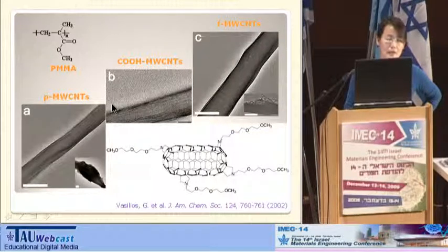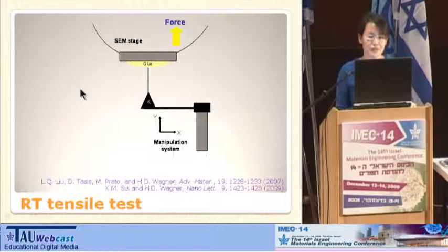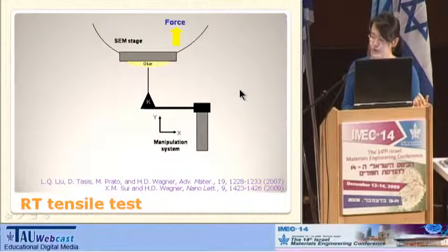In order to measure the mechanical properties, we need to control the tensile test precisely. Before this work, our group tried to measure the mechanical properties of these electrospun fibers inside the ESEM chamber. But we all know that the sample in the ESEM chamber suffers very extreme conditions, for example, high vacuum and all kinds of radiation. And also we know about the heating effect generated by the electron beam. And these effects will affect the mechanical properties of the polymer.